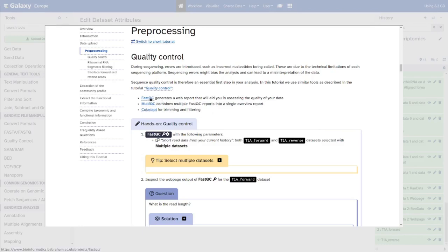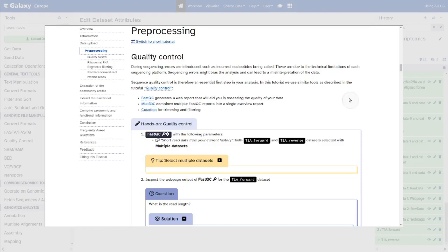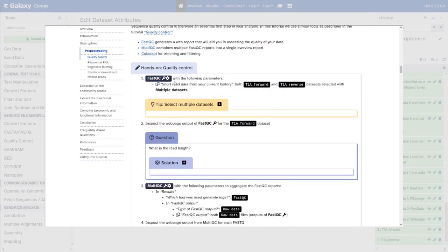We can also combine taxonomic and metabolic information to get taxonomic function quantification, seeing what functions are attributed to specific taxa. Additionally, we use visualization tools — especially Graphlan and Krona — which make the taxonomic information quite visually appealing, important for papers and presentations. So let's start with the quality control steps. We will do three QC steps: FastQC, which creates a quality report of your reads; MultiQC, which combines multiple bioinformatic outputs into one report; and CutAdapt, which trims and filters low-quality reads.